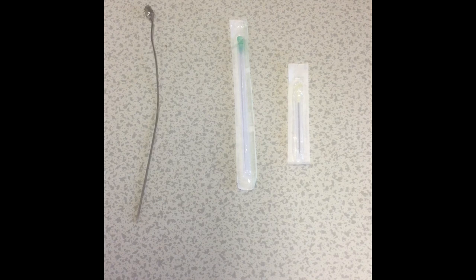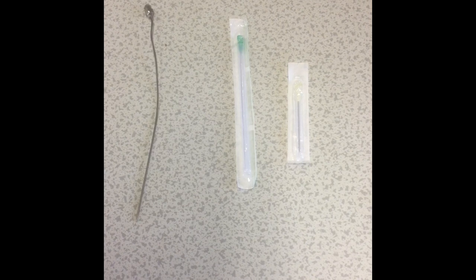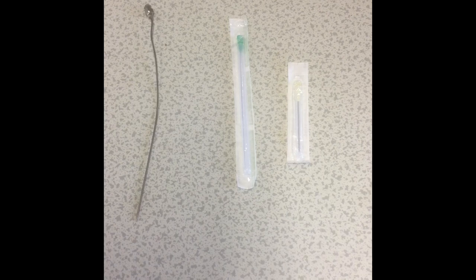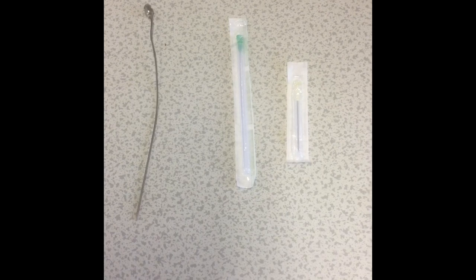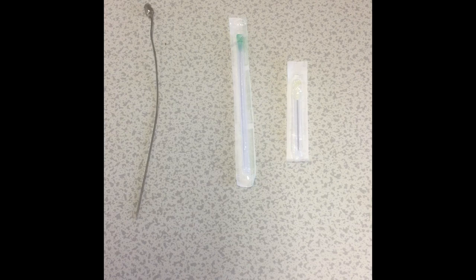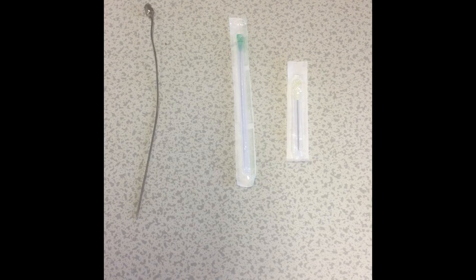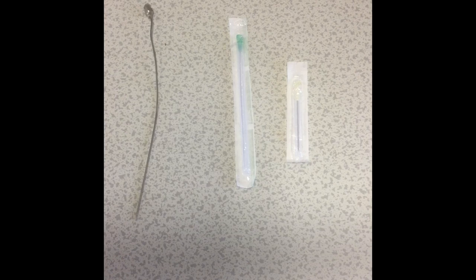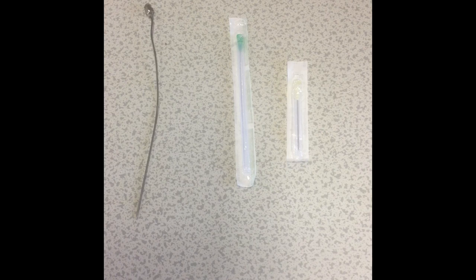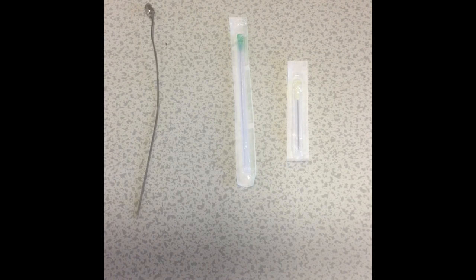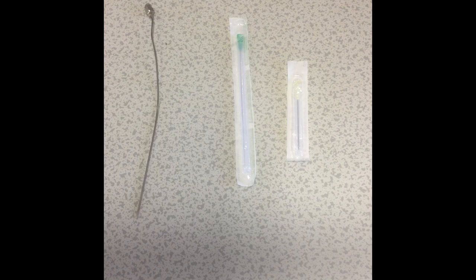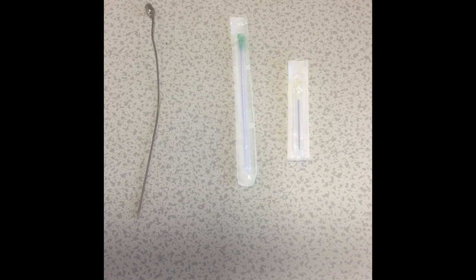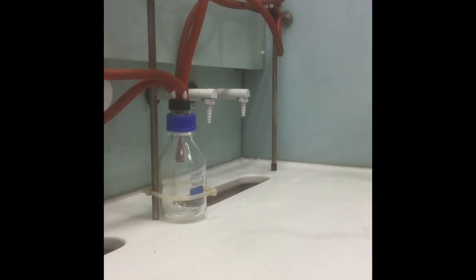The main hazard when using needles is puncture wounds. This video will show the best way to handle needles to minimize the risk to yourself and others. Once a needle has been used, there is a risk of more serious harm from chemical contamination if an accident occurs. We use needles to transfer liquids on the laboratory nitrogen lines or as an outlet for a sealed flask.